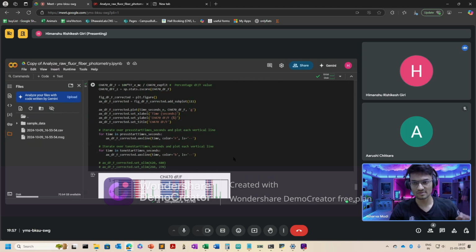They use other, more complicated frameworks, but they say it makes it more comparable from session to session and animal to animal. But it is a valid assumption that has been held true till now in the field, that you compare z-score directly. So that's the most basic thing you can do, and it's acceptable.